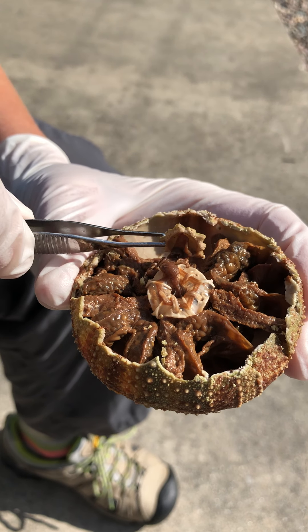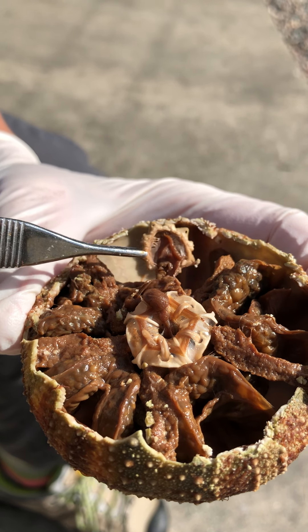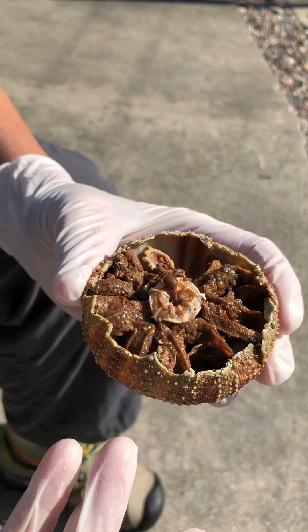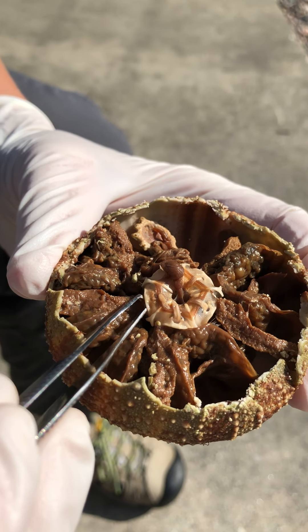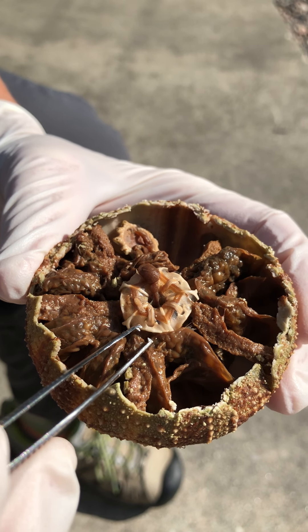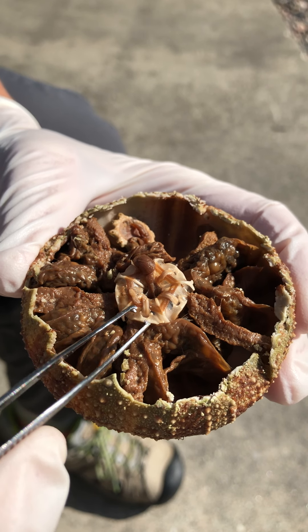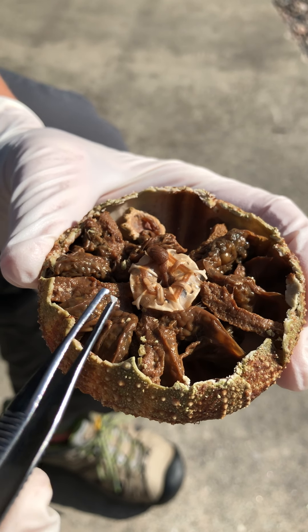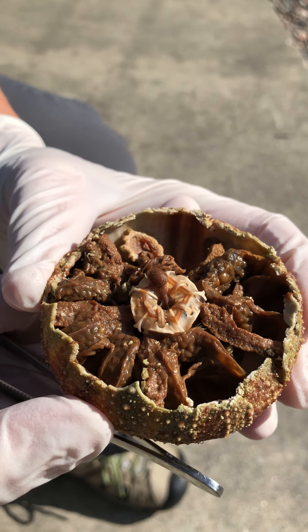I'm going to move them aside for a second. Notice that they're attached to internal structures — that plate is. So I'm going to move that aside, and now we can see this multi-parted feeding structure. It's got hard structures in it and muscle in it — it's a multi-parted feeding structure. Now we're looking at the aboral side of Aristotle's lantern.